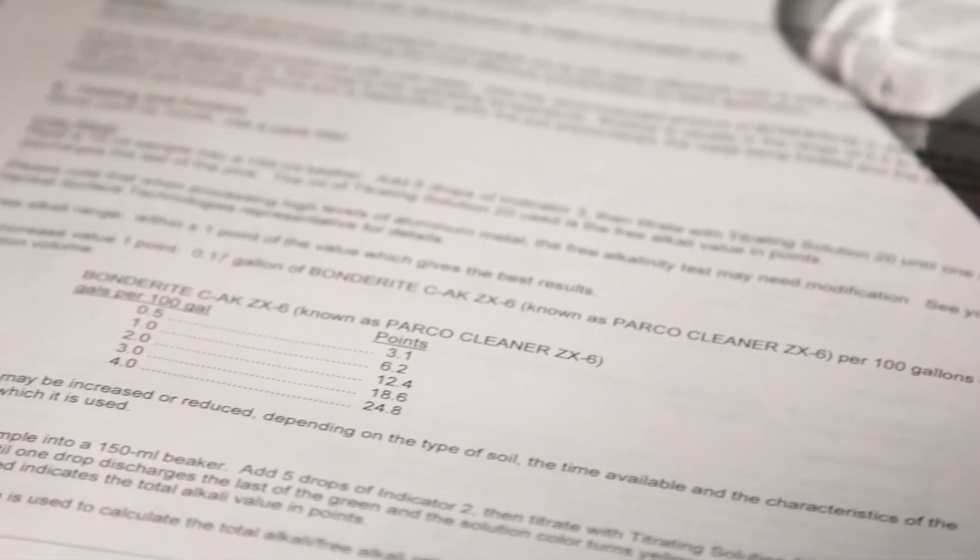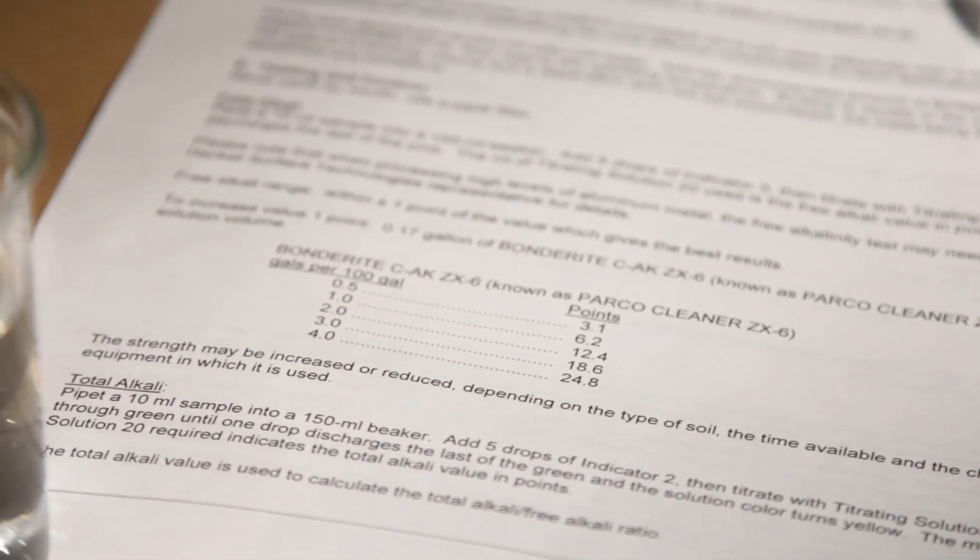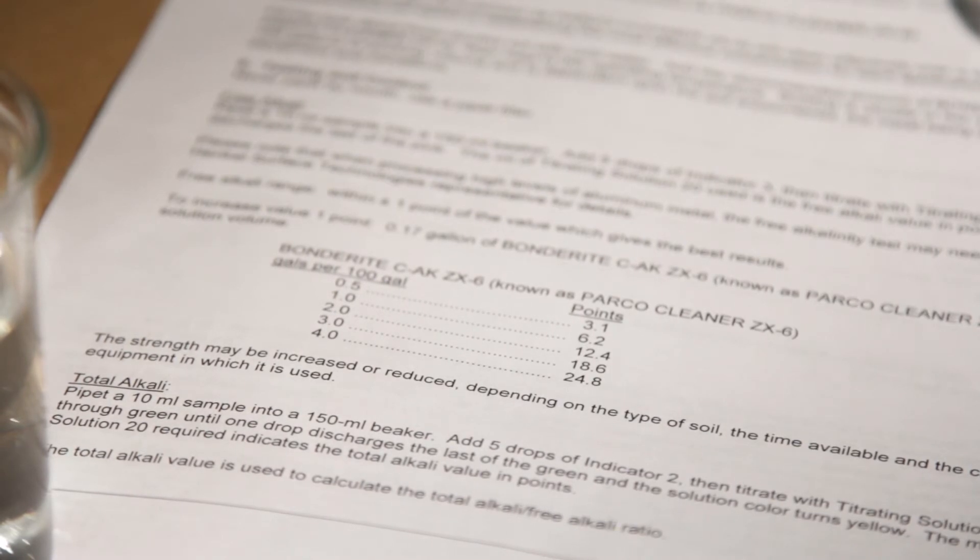We recommend that you set a range, and when titrating your bath, that you manage it within that range by making appropriate additions of chemicals.